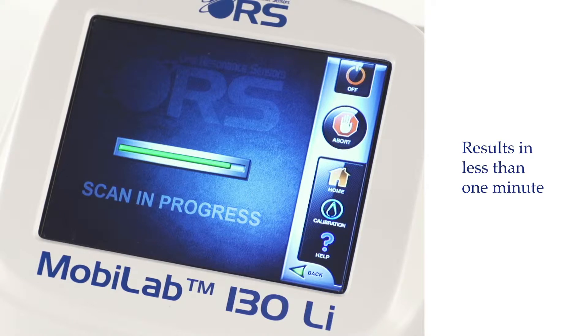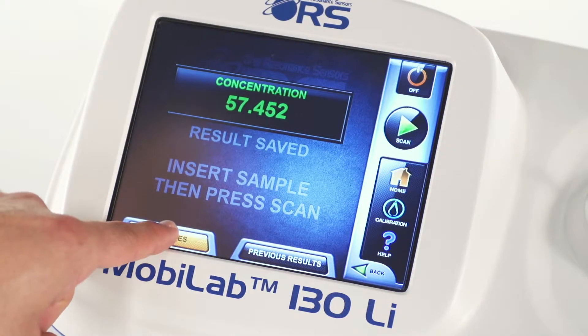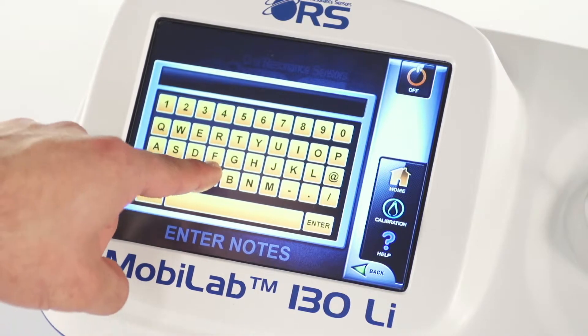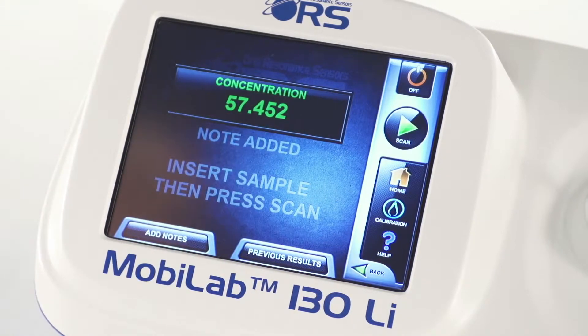The element's concentration value will be displayed in less than one minute, as soon as the scan is complete. These high-accuracy measurements are delivered faster and with a much simpler process than conventional methods such as titration and atomic absorption. The results are then stored in the log file of the MobileLab 130.